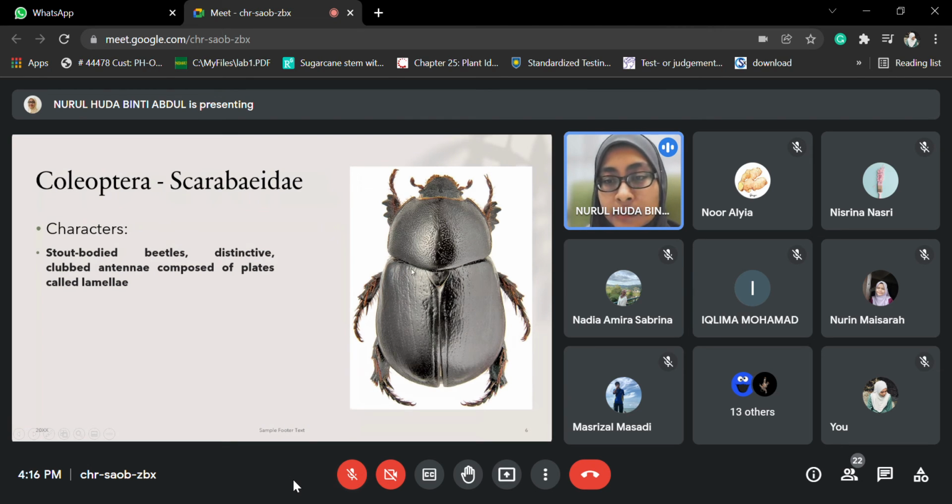there also ada striae which is macam lurah but not very much obvious. Okay, macam lurah ni maksudnya bukan dot tapi dia memanjang kan. But it's not very much obvious. There are also other beetles yang lagi obvious dia punya striae ni. Okay. Other than punctured, or apa lagi yang you can say about this organism?